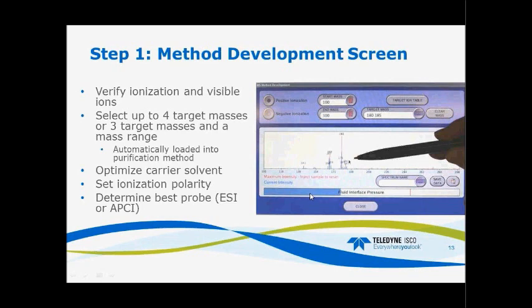What we're doing is monitoring the pressure of the line between the splitter valve and the probe itself, because we want to, A, make sure that the carrier pump is pumping properly, and B, this is also an indicator that once the pressure gets up close to this red line that you see here, there could be a clog forming in the system, and you would clean the lines prior to doing your purification to avoid stopping the system in the midst of your purification.